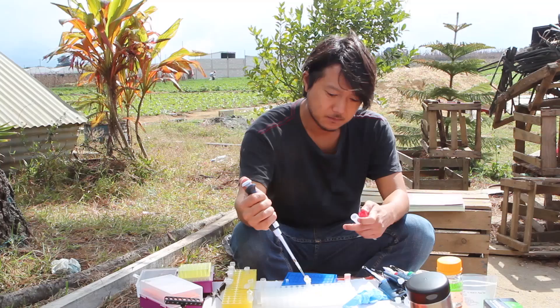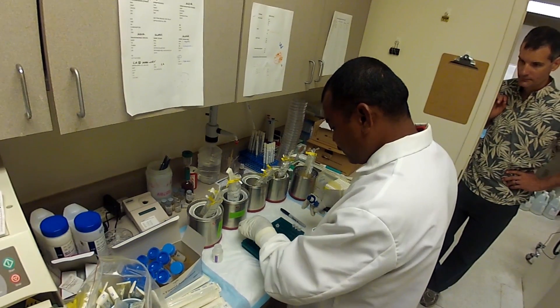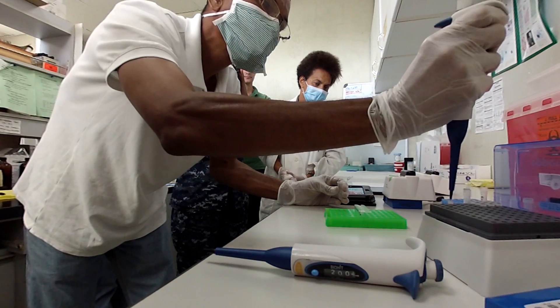From our travels we've also learned that there are many scientists whose budgets only cover the absolute basics of research, like gloves and pipettes. They are in need of equipment like the SmartDart to improve their work.